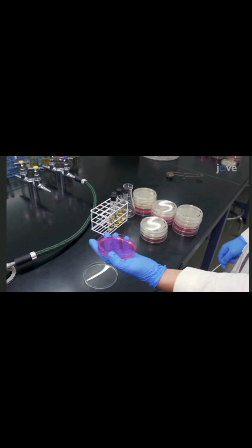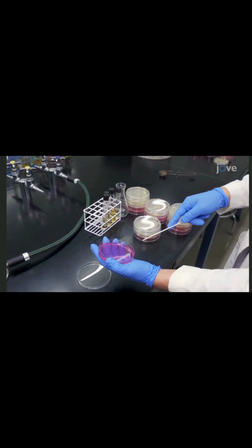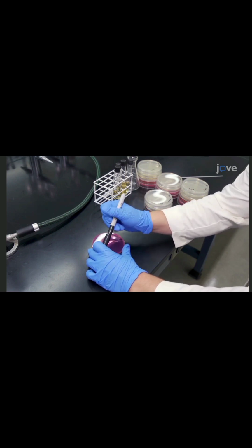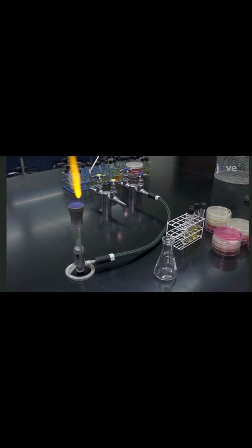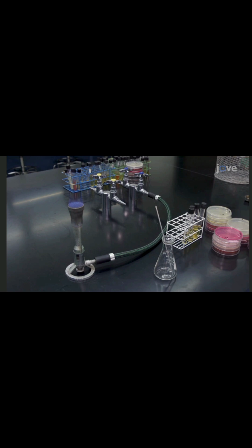Now that the first culture has been streaked, repeat these steps for the other bacteria to obtain 1 inoculated MSA plate, 1 EMB plate, and 2 TSA plates for each species. Once all of the organisms have been transferred, flame the loop one final time.